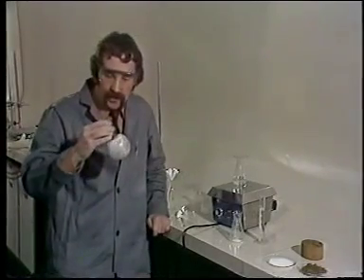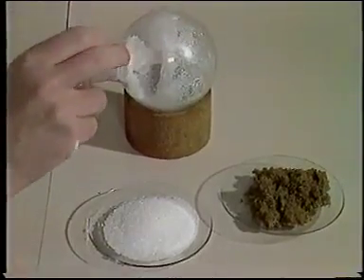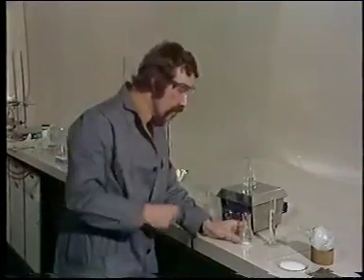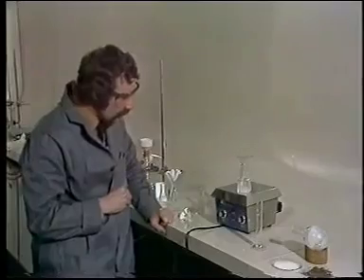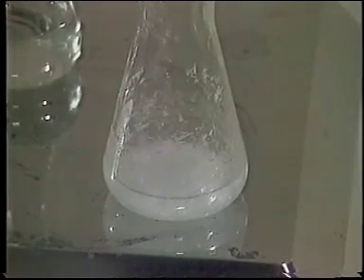Remember that first reaction? We've evaporated the organic solvent and we have a crude sample here of benzoic acid. It's not yet pure, it needs to be recrystallized. We recrystallize organic solids by dissolving them in the minimum quantity of a hot solvent using a conical flask. There are good reasons for using a conical flask, not least of which is that it stands nicely on the hot plate.